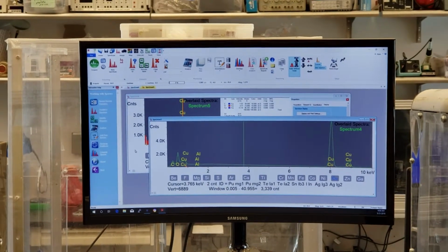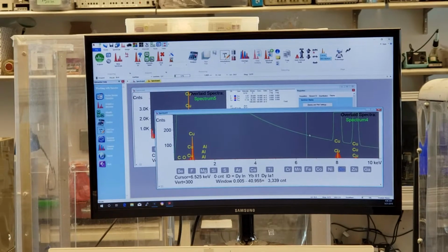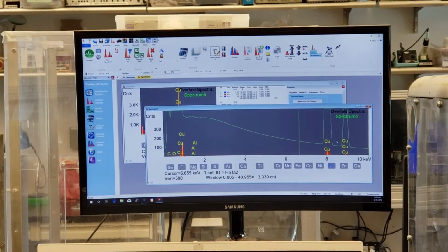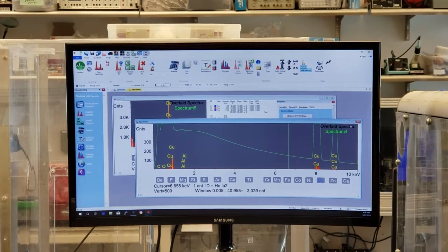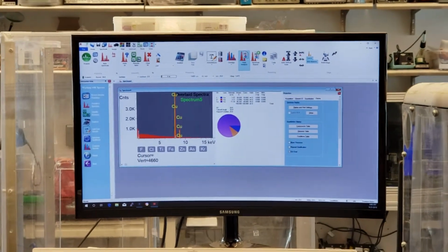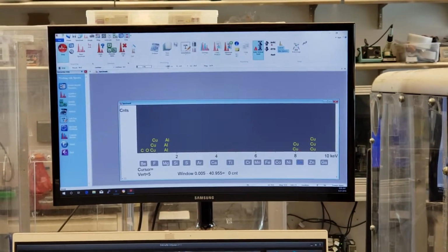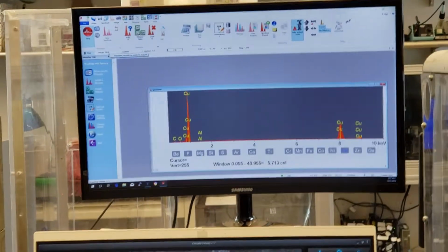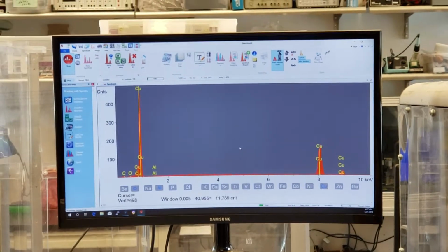So on this window, you could see if it had 80%, like the percentages were greater than what we acquired, right? Because there was more spectral information in the make-believe spectrum. But it's just for comparing, overlaying on top, and so on. So back to where we're from scratch, I want to acquire a spectra. We have good enough counts, 1,500 counts, and I recommend you acquire for at least 20 seconds. Right? So we're going to let this go for about 20 seconds or so.